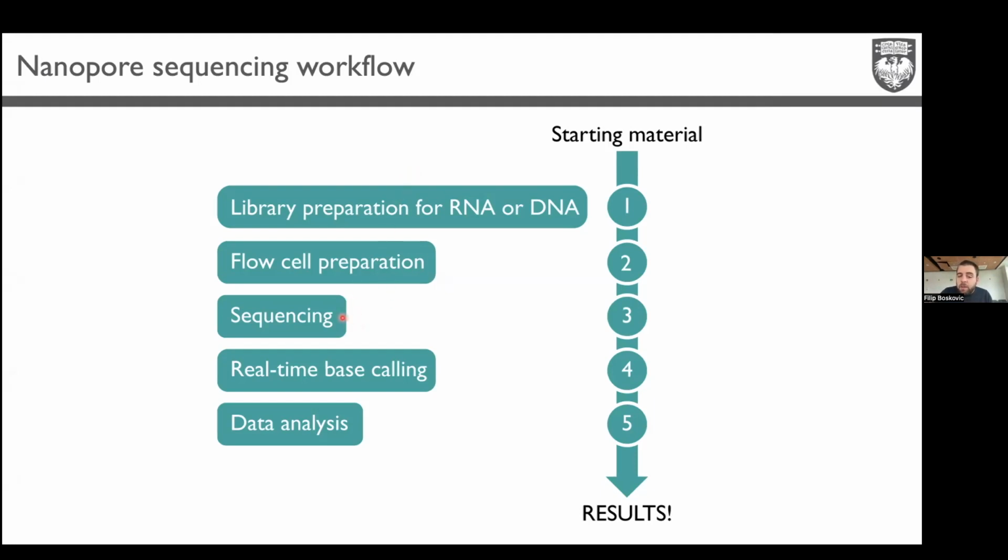There is one trick about the sequencing. It's called adaptive sampling. Adaptive means, okay, I'm looking for a SARS-CoV-2 sequence in the sample, and I just want to confirm if this patient is positive and what the sequence is. You can tell the software, and that's an automatic function.